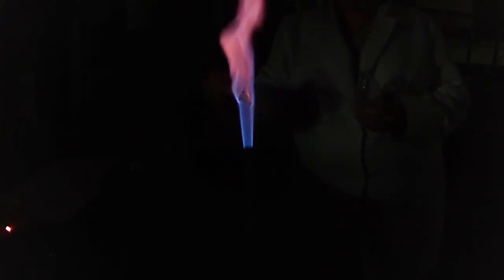Okay, and then unknown B gives us a purple flame. So you see that nice purple. Gives us a purple flame. So which one is that one? That's unknown B.